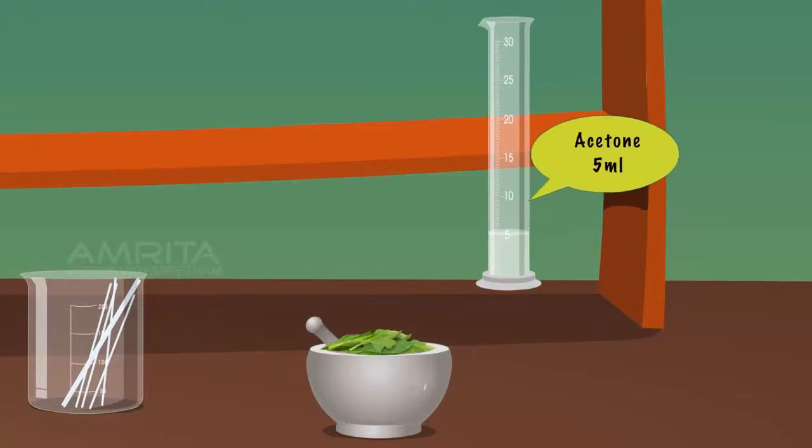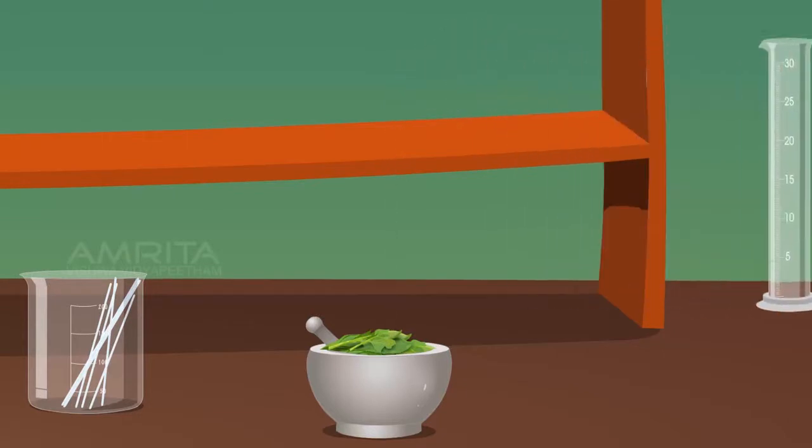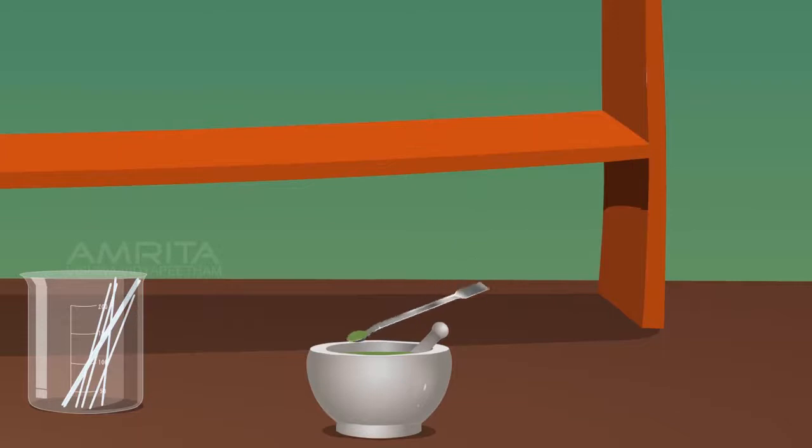Pour about 5ml of acetone into the mortar. Grind the spinach leaves using the pestle. Using a spatula, collect some extract into a watch glass.